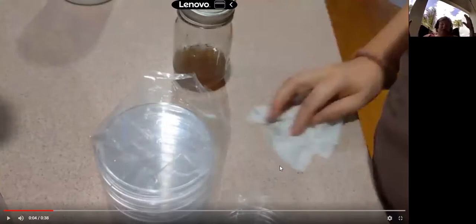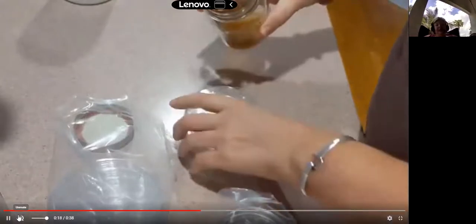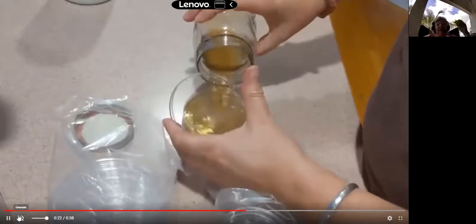So what you want to do is wash your hands, wipe down the counter space you're working on with Clorox or chlorine bleach or something like that. And then go ahead and start pouring your plates. You do this by taking your plastic plates out, taking the lid off your agar, and just generally tipping, making sure that you're covering the plates as quickly as possible after you've got the agar in there.